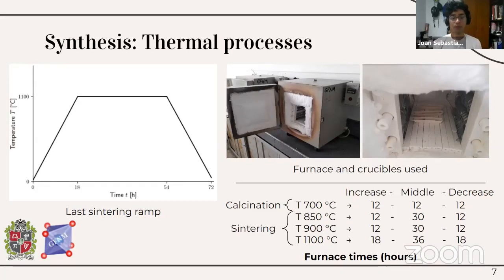After each sintering process, we also measured X-ray diffraction and scanning electron microscopy in order to check how the process was evolving. And that's about it for the synthesis.